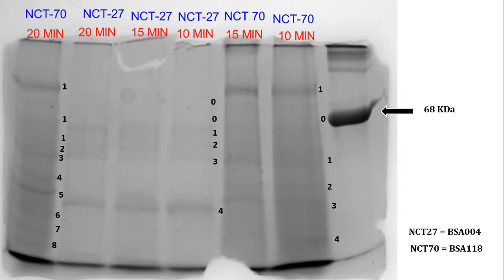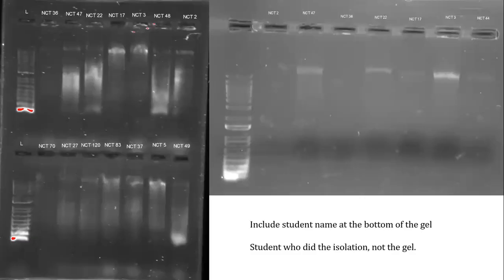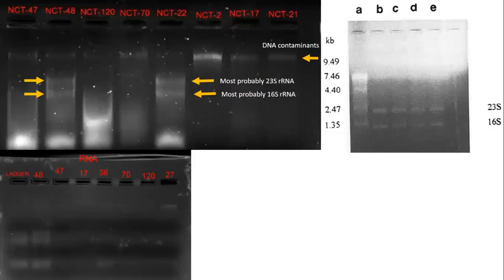Now, how to identify the species? Go for 16S rRNA. First step is DNA extraction. Extract the bacterial genomic DNA. Various methods are there. Salting out I usually use, or you can go for phenol-chloroform. Then go for PCR.